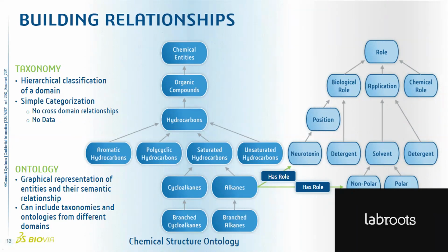Some of them are about usage. Has the same material been used in different roles? And you could have many different roles depending on whether you're talking about an analytical chemistry lab, a biology lab, or a standard small molecule chemistry formulations lab. The same material could be used in different places and many different ways.